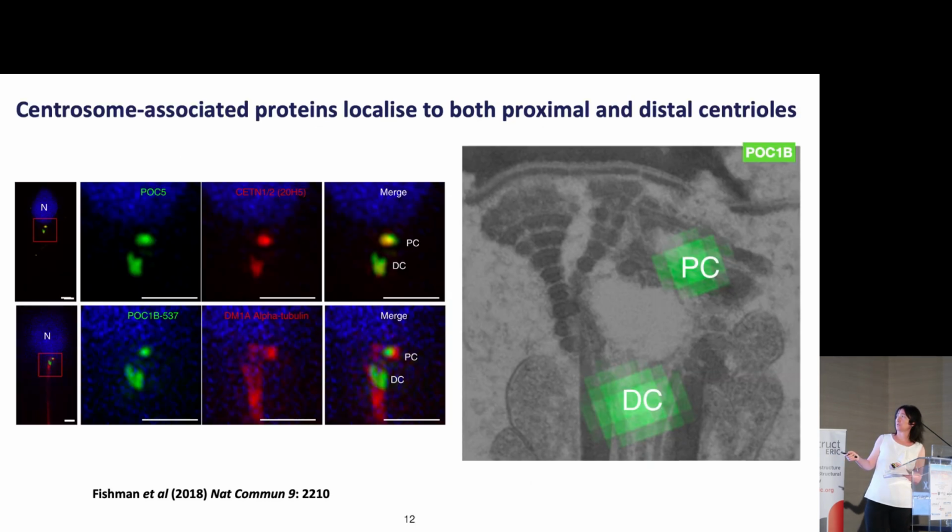So our collaborator, Tomer Avidor, in the US, actually did some nice super resolution fluorescent microscopy, and found that you can see 2 parts where you can localize and find centriole proteins. But you can see that the other one looks already quite strange. And they also did correlative electron microscopy, and they could see another signal for more proteins.